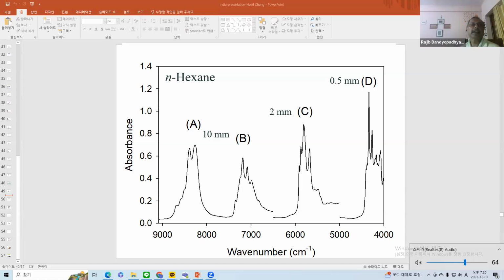Okay. Actually, signal to noise ratio depends on the detector primarily. So if the instrument is made, no one can change it. Yeah, that is true. Or maybe you might want to use a very intense, bright source. So there might be that possibility, I guess. Yeah, the signal will be more, and the noise ratio will be lower.